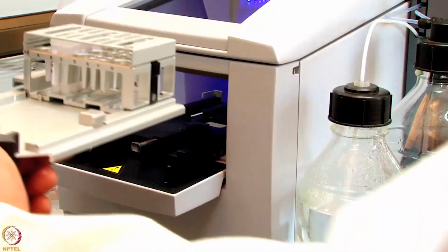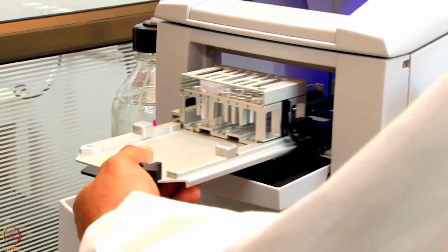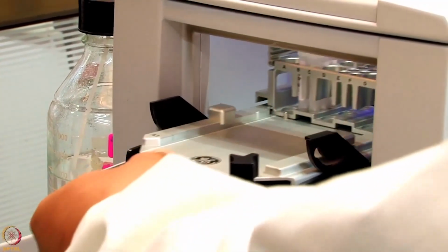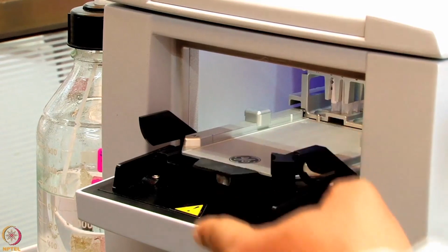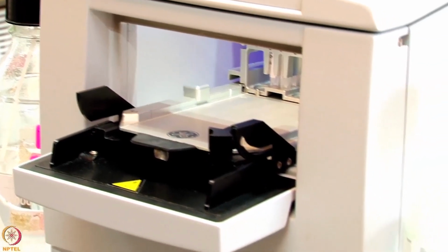We will insert the rack into the sample compartment this way, and we need to lock it inside, and then go on the screen.